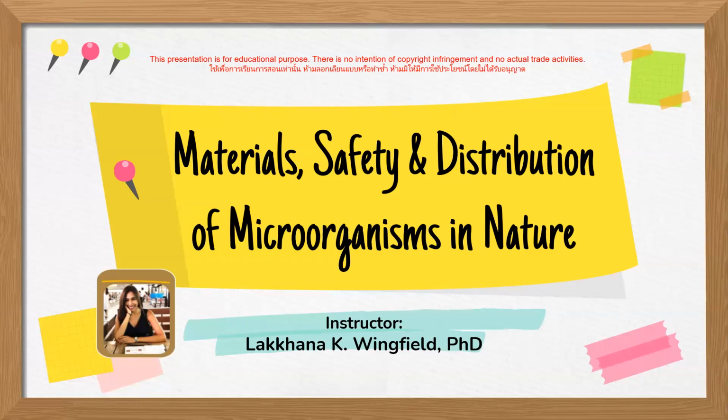Hello, welcome to Microbiology Practical 1. Today, we are going to learn about materials, safety, and distribution of microorganisms in nature. The objective of this experiment: first, I would like you to know the tools and equipment used in microbiology laboratories. And second, I would like you to be able to indicate the distribution of microorganisms in nature.